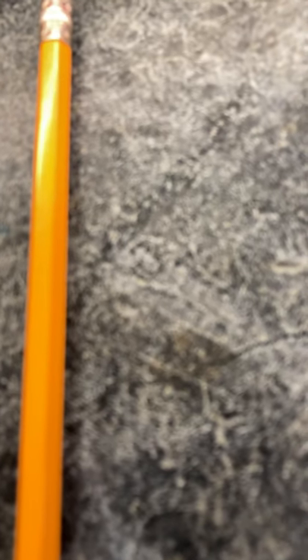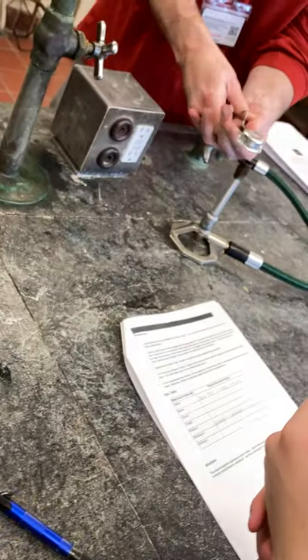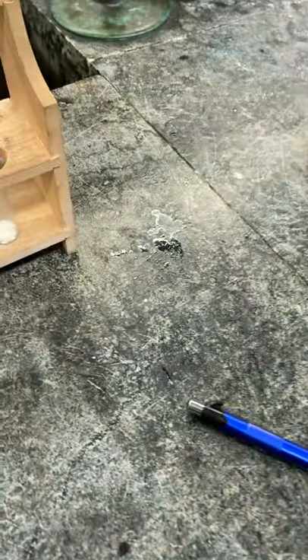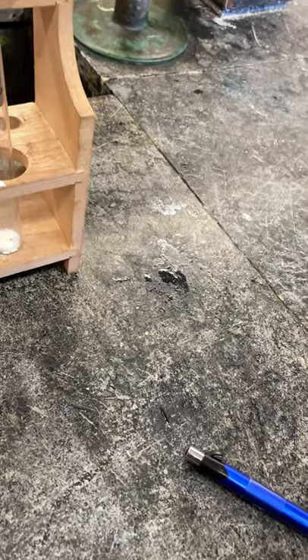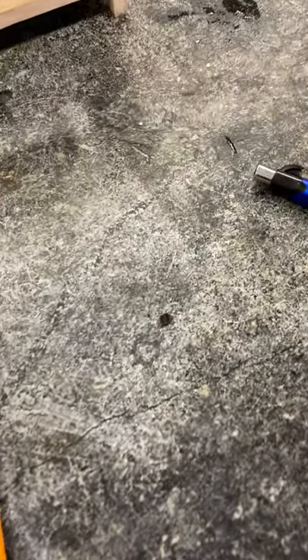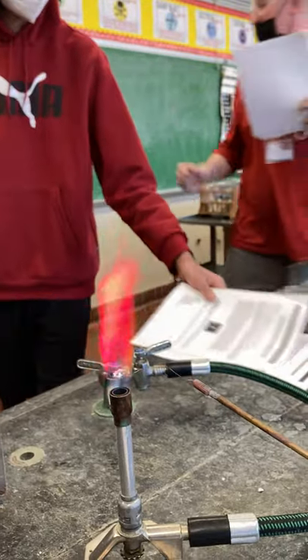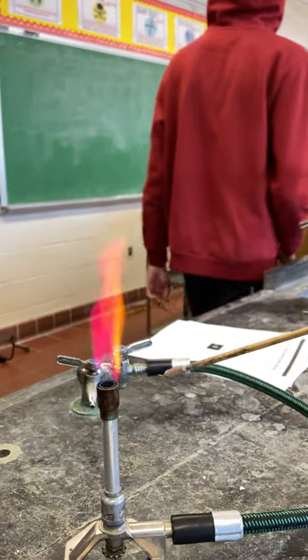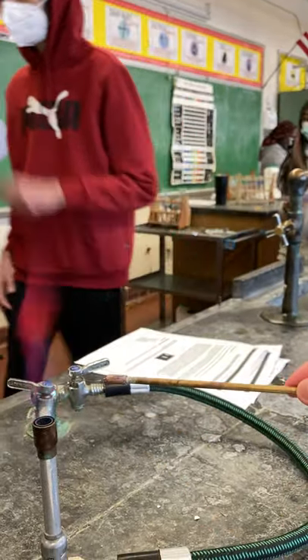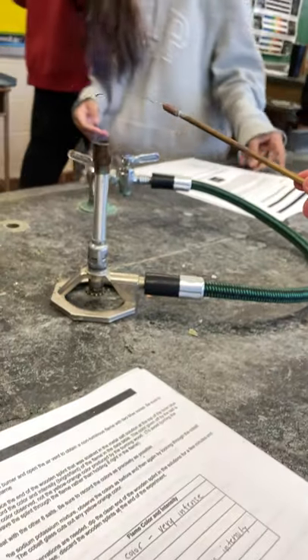Let's turn this on. Do it quickly. Put it right on top. I'm trying to. Sometimes some of the strikers are messed up. Lithium is definitely the best one. Look at that. Yes, right here. This is the best one. The other one's still good. Good job today, guys. Excellent work. This one's definitely the best one. Yeah, I got you.